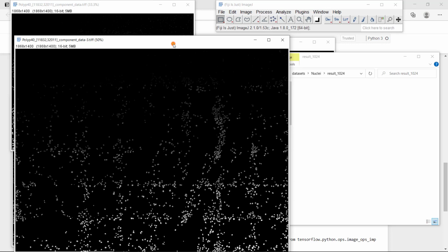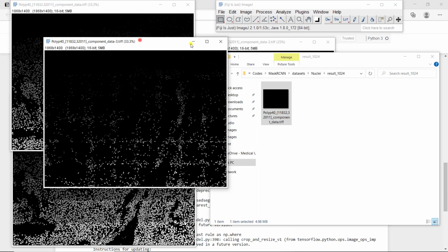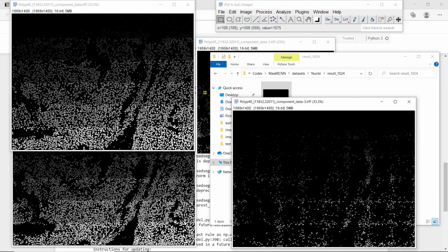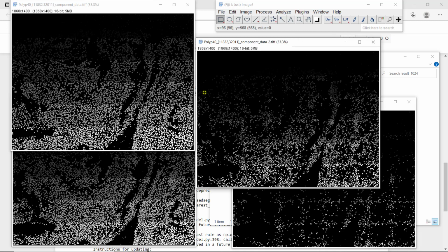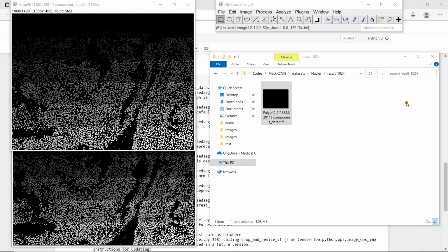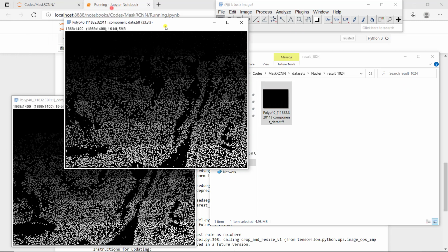So as you can see, those 2 last ones clearly are not optimal. We have fewer nuclei. If you look at these 2, you're going to see that here nuclei are smaller than here. So that's what I was saying at the beginning. The more you increase, the smaller the nuclei you're going to get. So here, clearly, the choice is going to be between those 2.